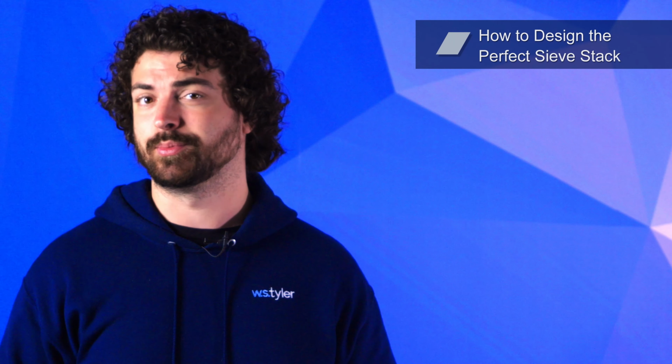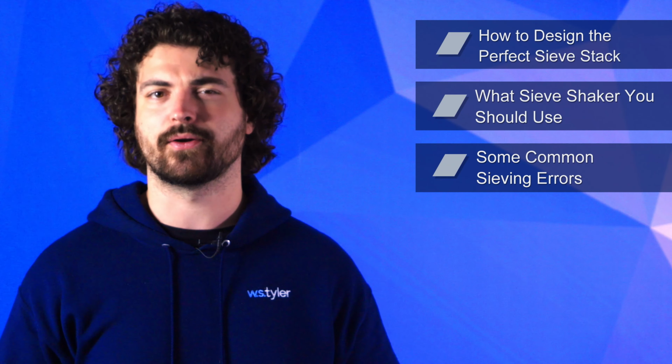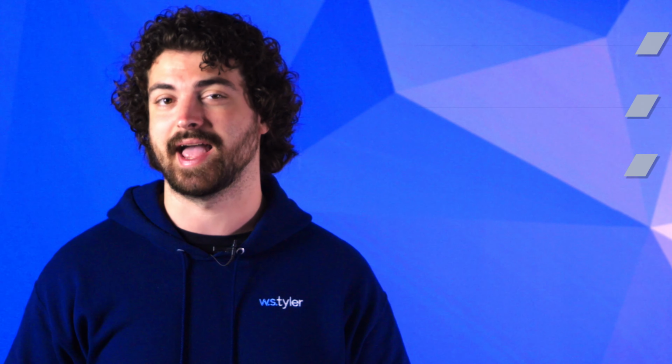W.S. Tyler has been a top manufacturer of test sieves for over 150 years and is here to provide insight into everything you need to know about designing the perfect stack of test sieves. So in this video, we'll go over how to design the perfect sieve stack, what sieve shaker you should use, and some common sieve errors you should consider when designing a sieve stack.